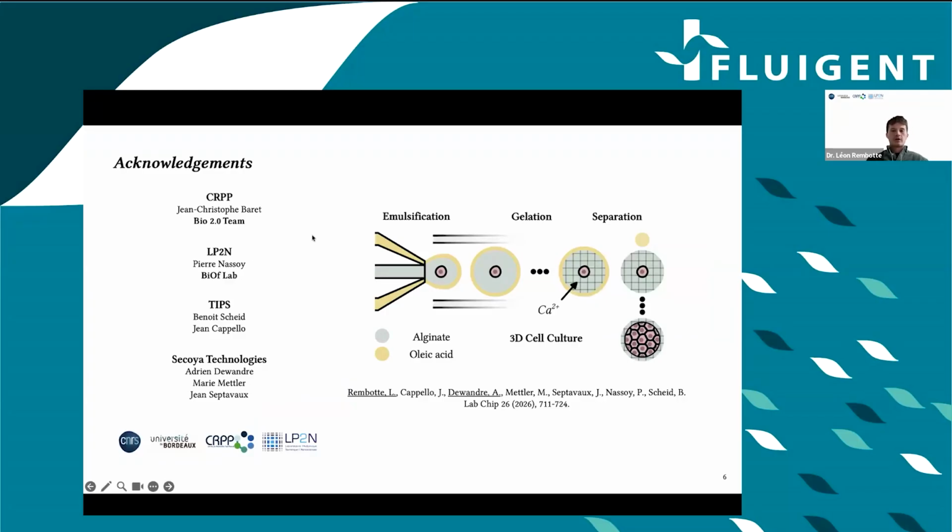So, just to finish, I will recapitulate what happens in this system. We have these Raydrop chips that allow us to form alginate microbeads with liquid alginates. We collect these beads in a calcium bath. Calcium ions cross a very thin shell of oil, diffuse through the alginate, and reticulate it from the inside slowly, which leads to a homogeneous reticulation.